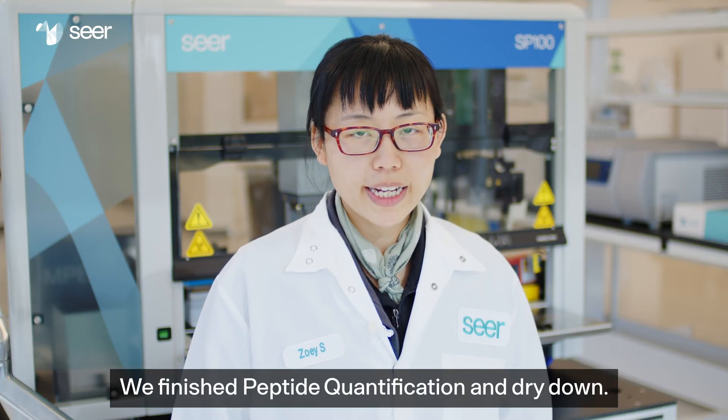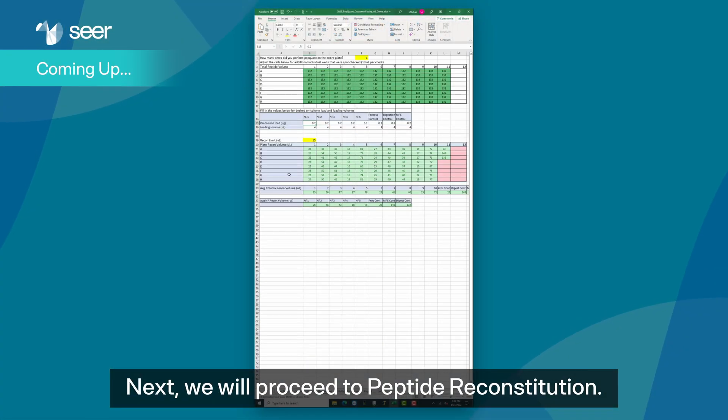We've finished peptide quantification and dried down. Next, we'll proceed to peptide reconstitution.